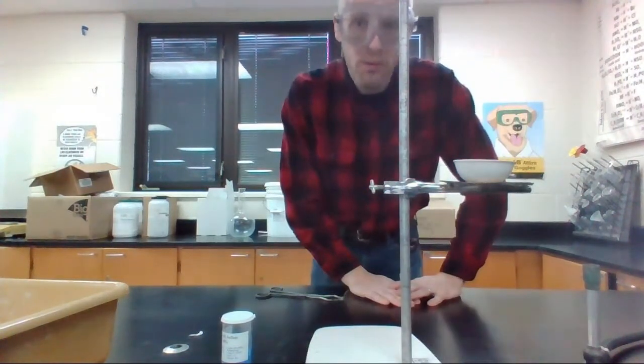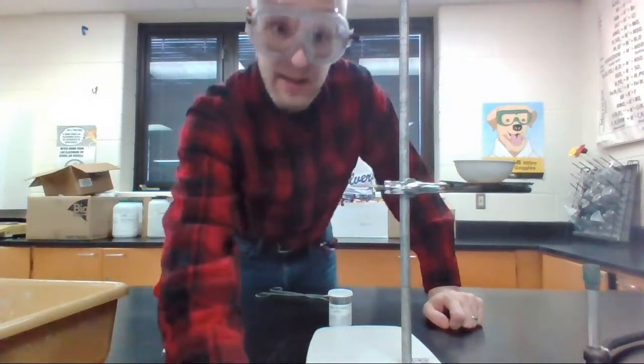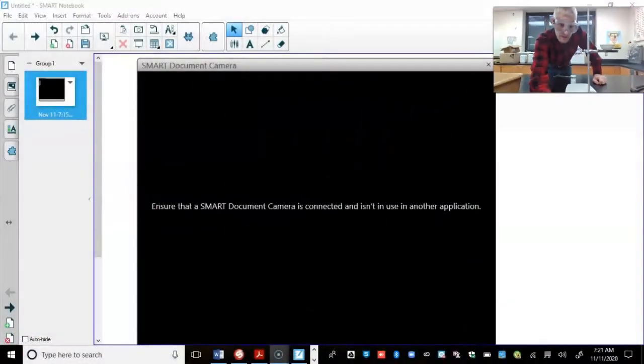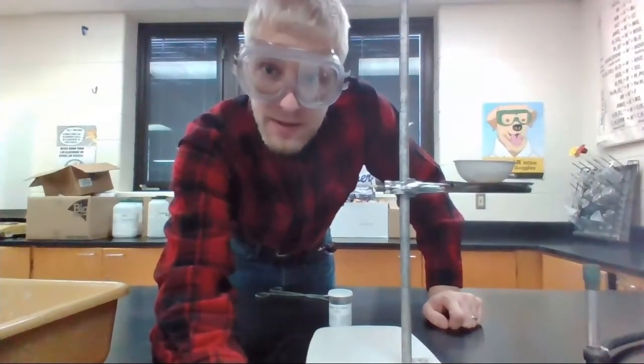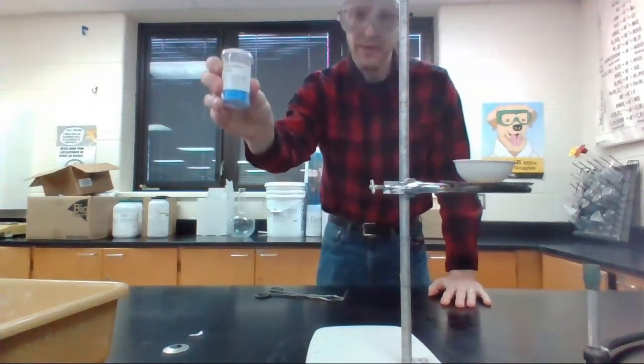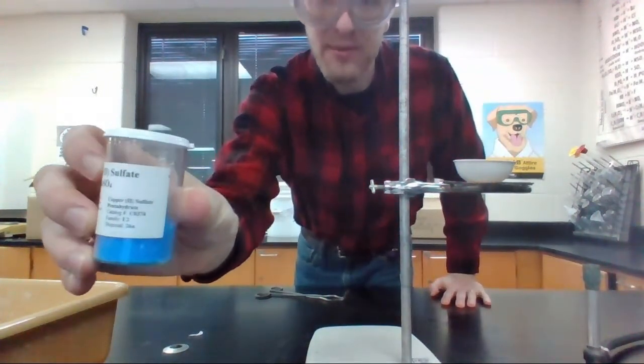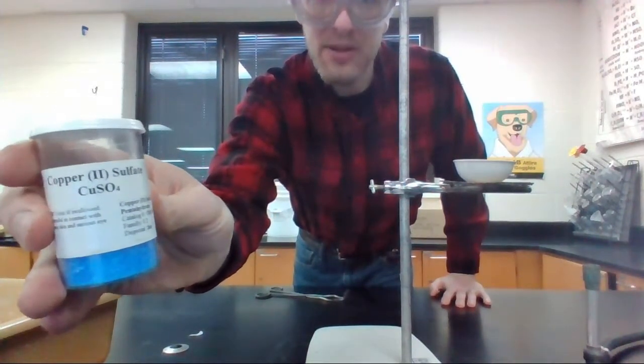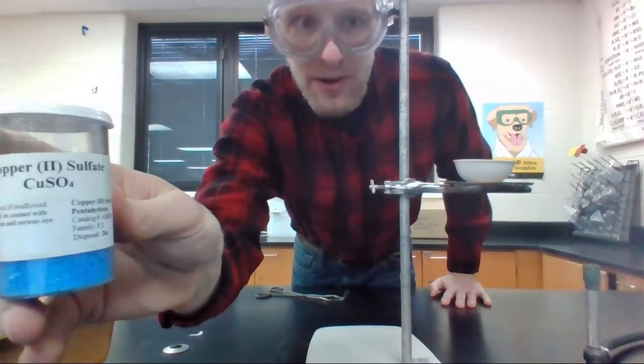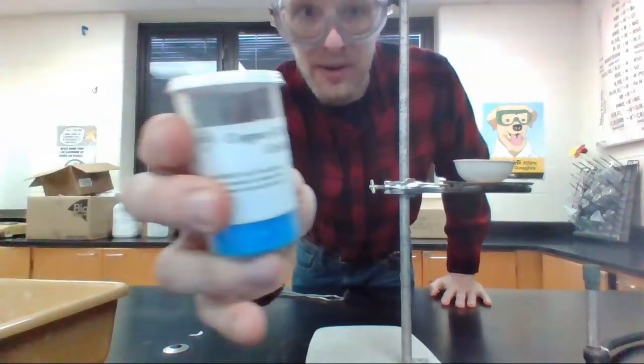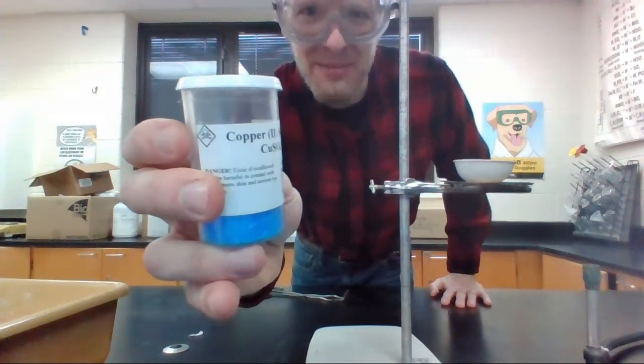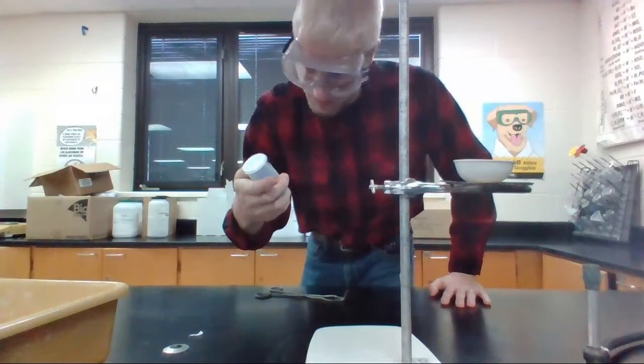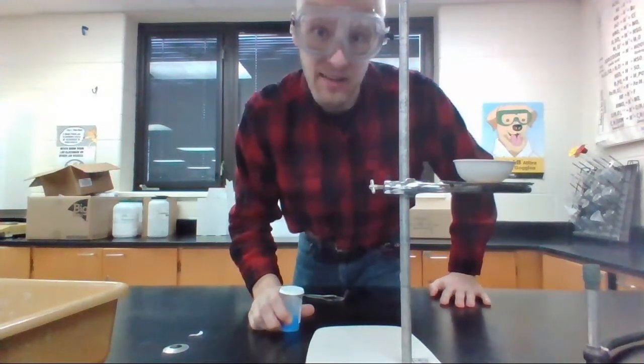And what we're going to do is I'm going to pause this video one second just to make sure that it's actually recording. It is. Good. Perfect. Here we go. This is the chemical. Can this focus? Let's see. Copper 2 sulfate. CuSO4. Let's look at the hazard label. Oh, where is it? There we go. Oh, skull and crossbones. Looks like I'm going to be dealing with some heavy stuff today.